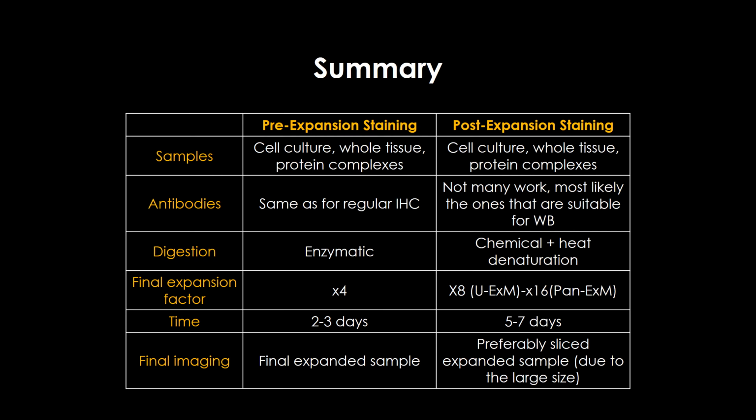In my hands, when I use the ultrastructural expansion, I used this red antibody, which worked really fine. The digestion in pre-expansion staining is enzymatic, and in post-expansion staining is chemical digestion and heat denaturation. Final expansion factor for pre-expansion is 4 times, for post-expansion up to 16 times.